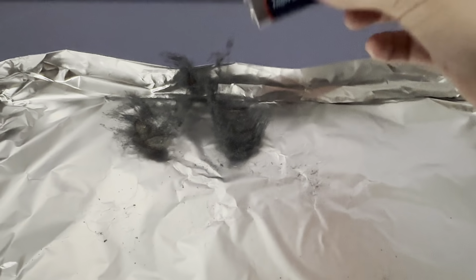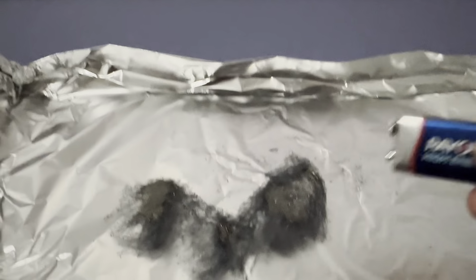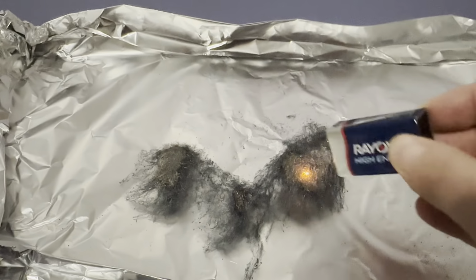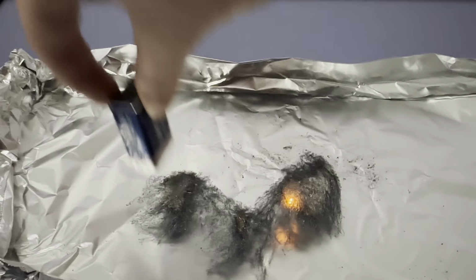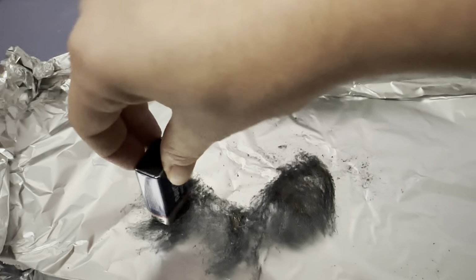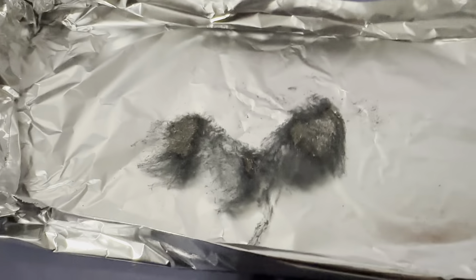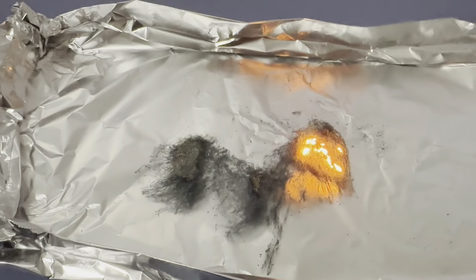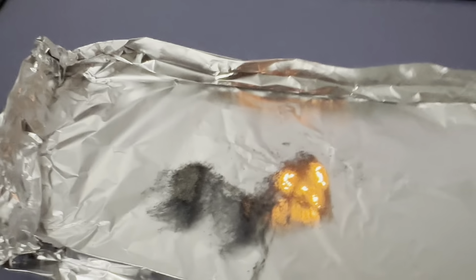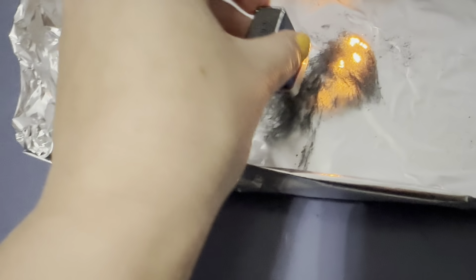See, there's a little bit of unreacted. If I flip it over, I can see this is unreacted, so I'm going to hit it back there and let all that go. And there's also a spot over here. I don't know if I can get that to go. It is really rainy today, so humidity sometimes makes this not work. So I'm just going to be patient with it and play around with it until I get it all reacted. And you can too, have fun with it.